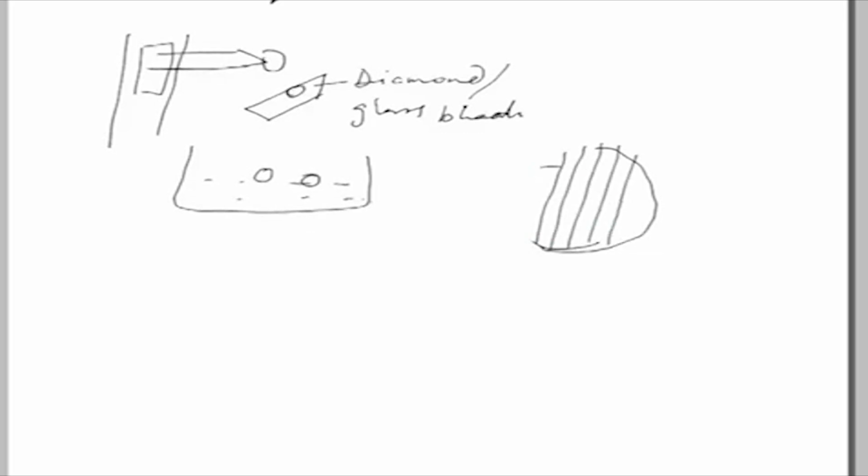It looks something like this, which has a mesh size, and a specimen will be put in at these meshes, and this will have a holder here. Now, once these are stained in here, and dried and then finally rinsed with distilled water, they could be placed into the electron microscope for viewing. So, that is how the whole thing works.